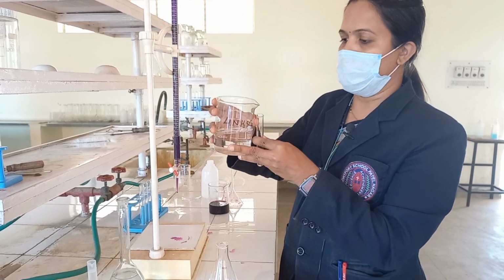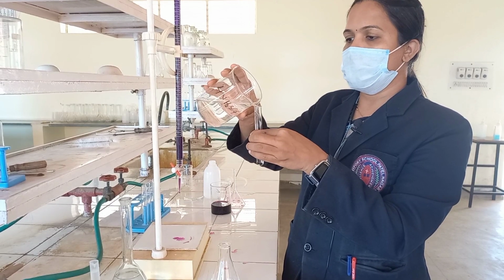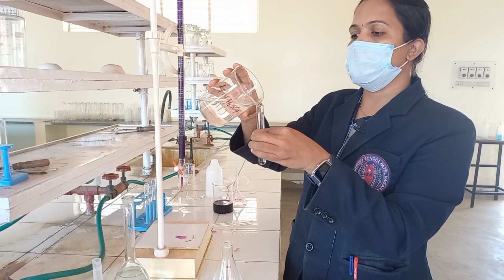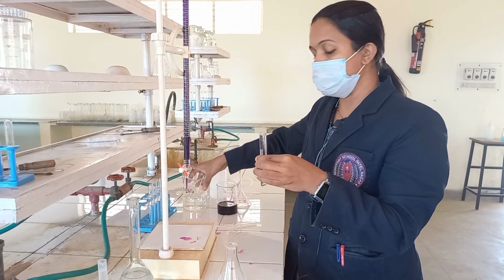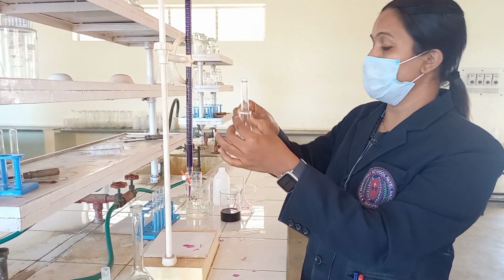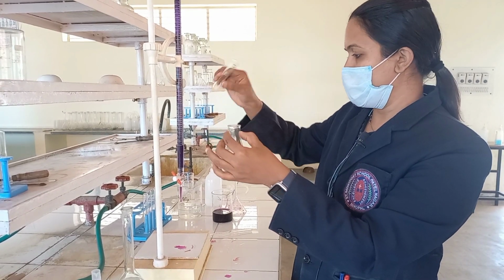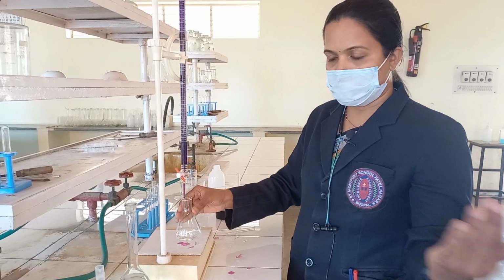Now students, very important one, 4N H2SO4. For the 4N H2SO4 solution, you all have to take one test tube, because this 4N H2SO4 solution provides the acidic medium to KMnO4. So I am pouring one full test tube of 4N H2SO4. Just pour that one test tube and then let's start performing the experiment.